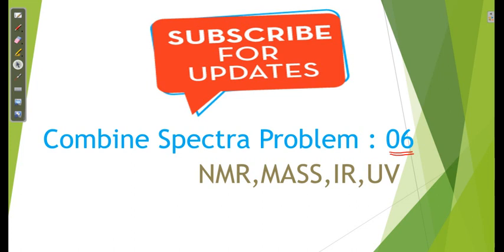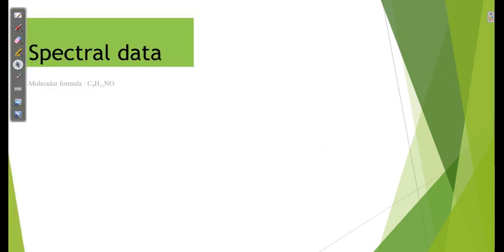Nitrogen and oxygen are present in the given molecular formula. So normal people can always think of the presence of NH2 and OH. Let us see the spectral data we have. It is very easy for us due to the given molecular formula.